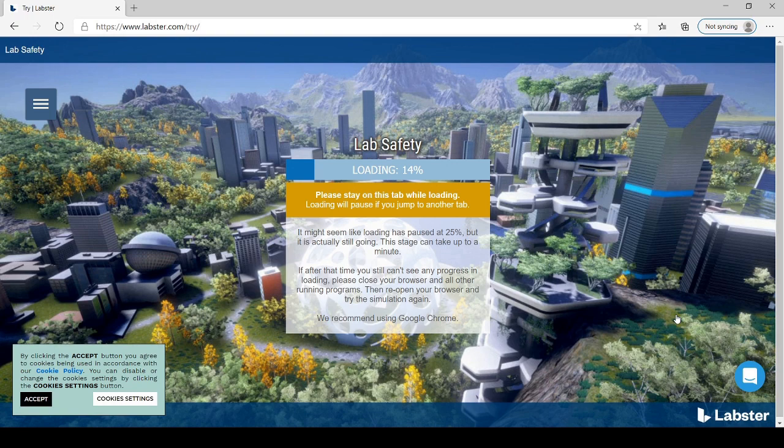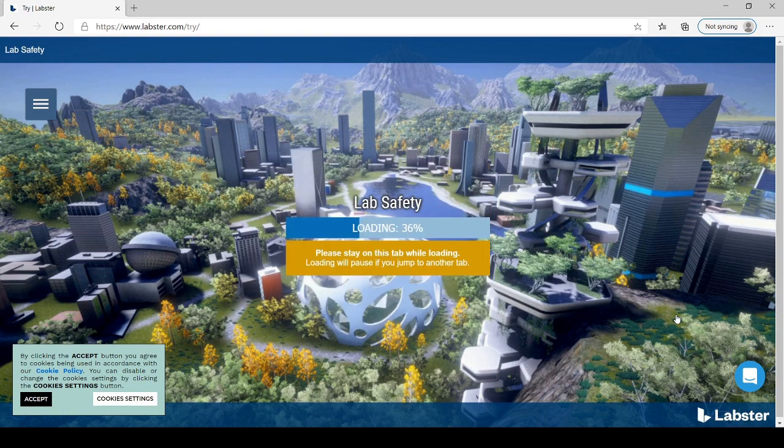Here it starts from the dress code to the implementation of the labs. So it is one of the most fruitful virtualized simulations available to us. I would say that everybody should at least try this type of virtualization lab where students can actually get the feel of what the labs are all about.